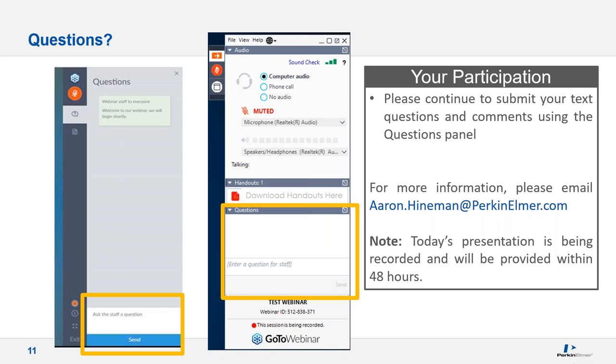Yeah, the sapphire and quartz injectors too. The other thing you could do is increase the auxiliary flow a little bit, from maybe 0.2 to 0.3. That will move the base of the plasma away from the injector, so you'll get less deposition coming out of the plasma onto the injector. So 0.3, 0.4 sometimes for the auxiliary flow. Yeah, that's a good point. It does help.